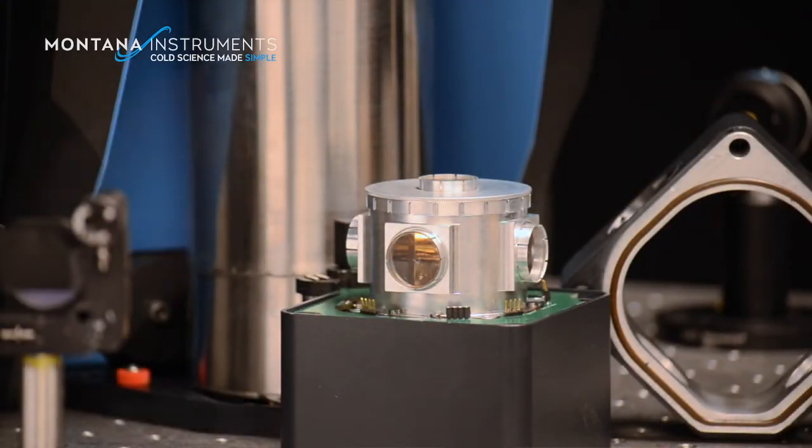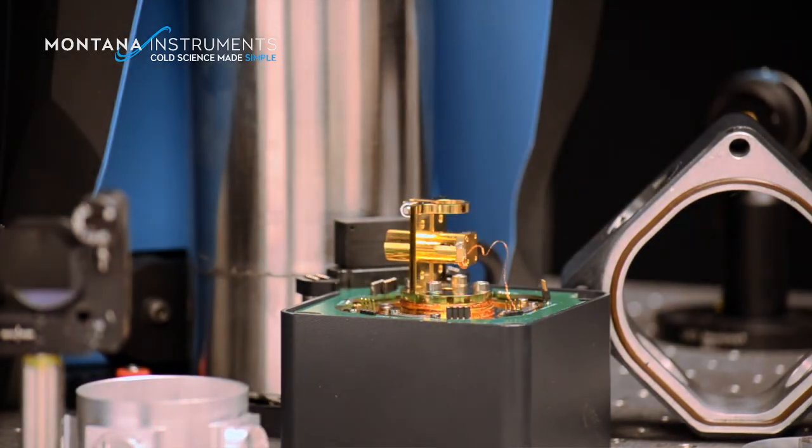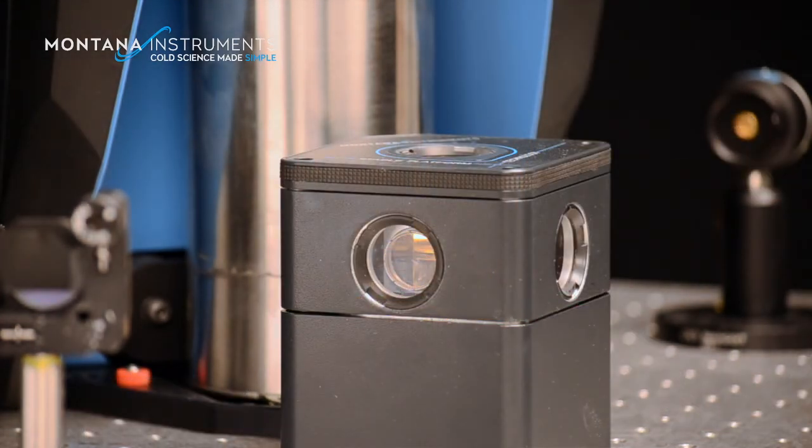With unprecedented optical and electrical access, complete automation, and powerful options, you can begin your next set of experiments simply, predictably, and right the first time.